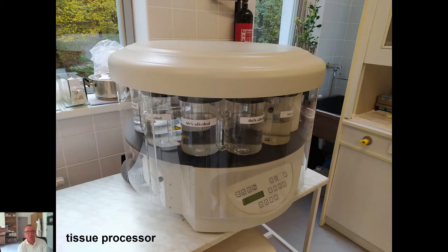Of course, we can do it by hand, but the bigger laboratories have some machines for histological techniques. This tool is called a tissue processor, and it allows automatic dehydration, clearing, and infiltration of the tissue.